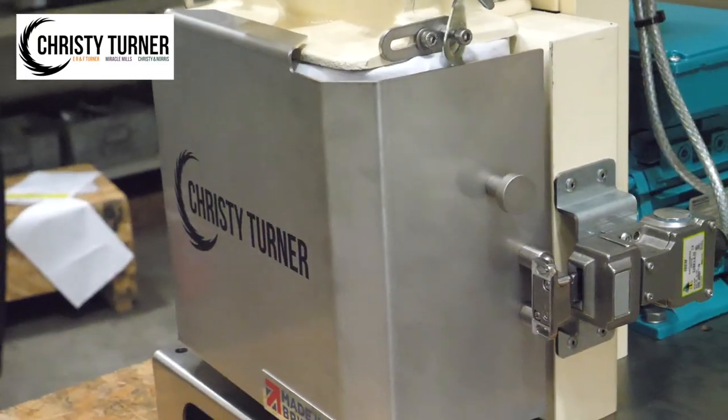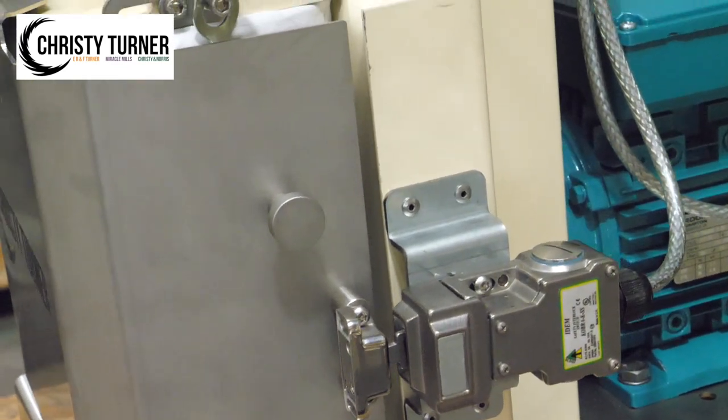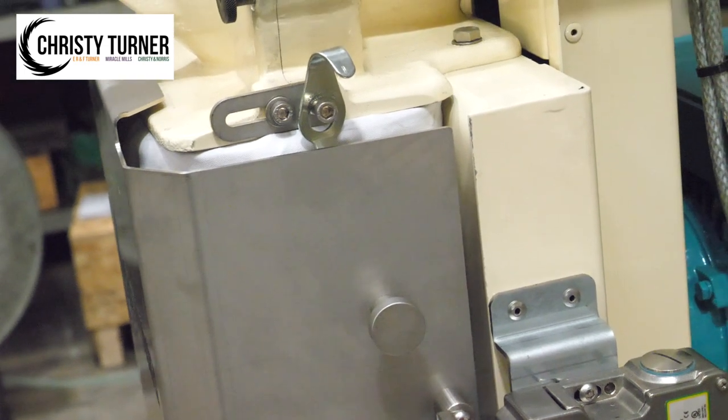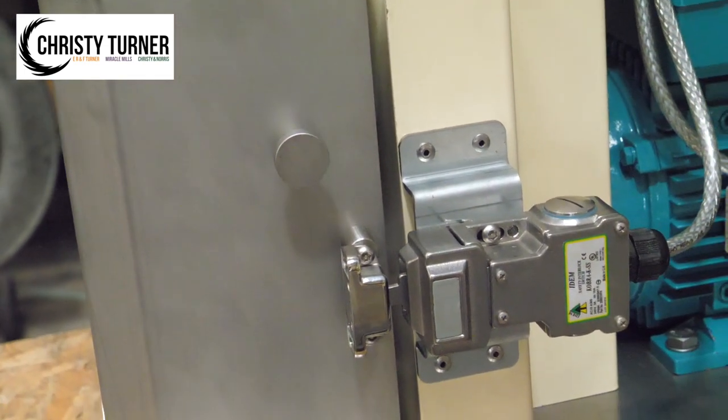The hinged front panel not only facilitates easy cleaning, it is designed with an integral safety interlock, so should the front panel be opened while the mill is in motion, the motor will instantly cut out to isolate the Betacross.